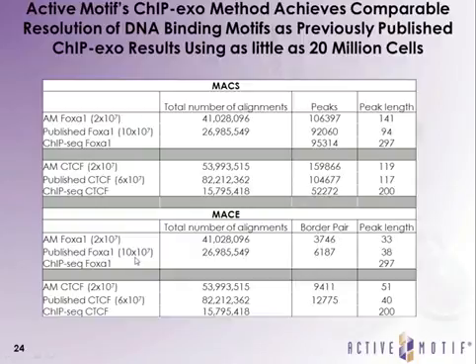And as you can see, with higher numbers of cells, you actually are able to identify more binding sites, whereas we only use 20 million cells here in our experiment. In 100 million cells, you actually about doubled the amount of binding sites that are identified using MACE. So that's just a warning to say that you can get data with 20 million cells, but if you use more cells, you're going to actually get more binding sites that are identified.